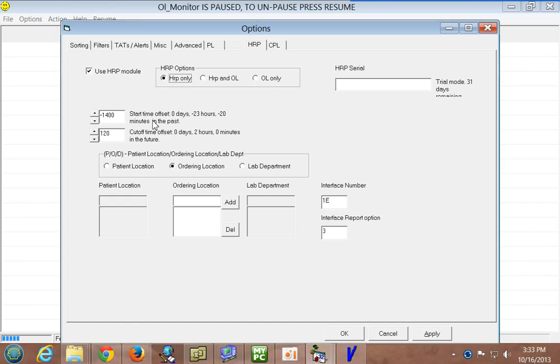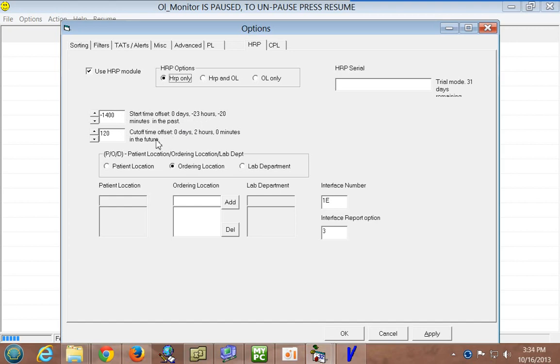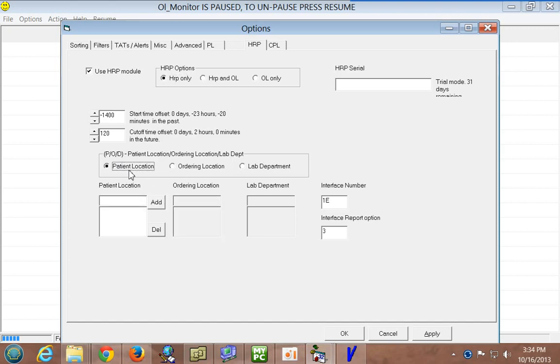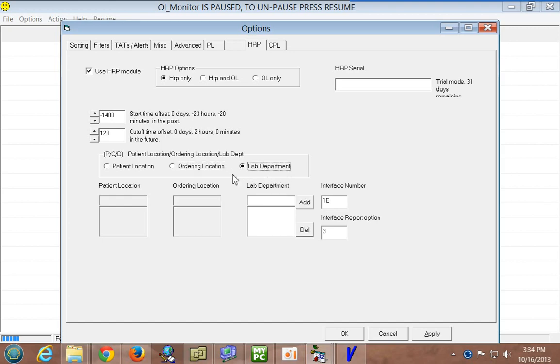If you have messed with the PL module, you'll remember that you can set a range of time for the report to search back and to search forward. You can see that I've set it to look for orders within the last day and up to two hours in the future. P/O/D here, you have three options when you're doing the orders not processed report. You can go by patient location, ordering location, or lab department.